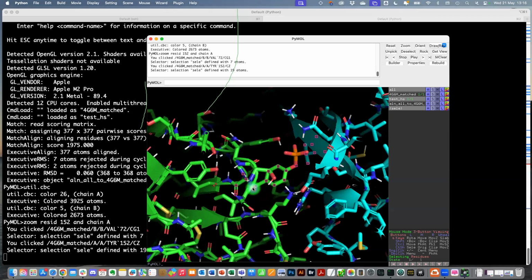So, you know, you can change names, or you can do the systematic scanning, or the alanine scanning, which allows you to define, I want to mutate this residue, and you can give it a list of mutations also. And it gives you a plot, an interactive HTML plot, where you can look at the results. But in this case, it minimizes it, it put it there.